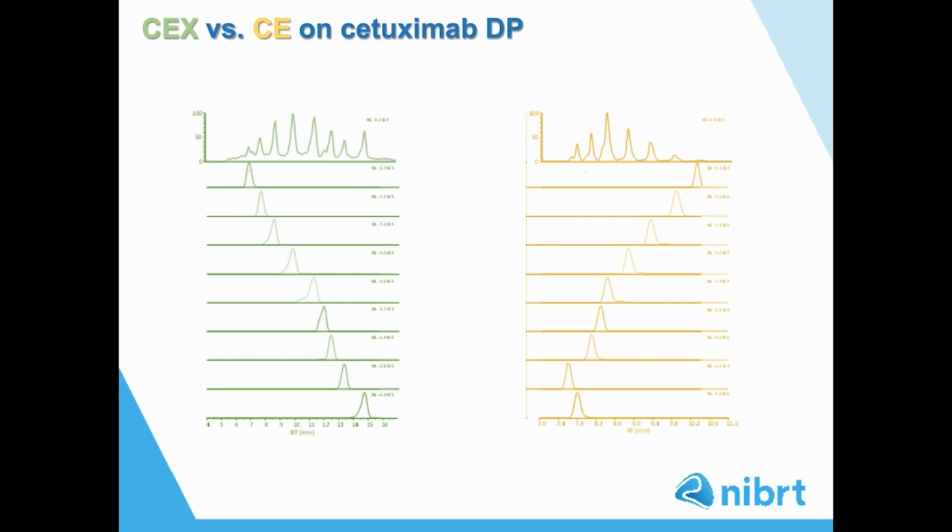As expected, the elution order in CE is opposite to what is obtained in CX, and we obtain in both cases 9 proteoforms that basically were differing for the content of C-terminal lysine, sialic acid, and so on. This experiment really proves that cation exchange chromatography and ZipChip MS platform can provide orthogonal selectivity that really enhance the confidence in the annotation of the resulting native mass spectra.